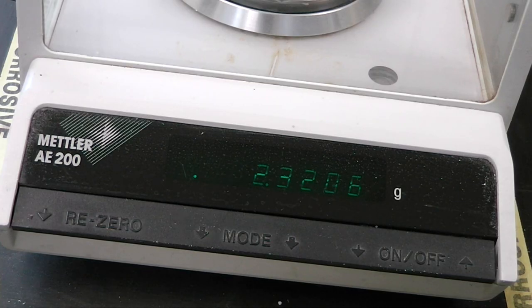When taking your final reading, be patient. The number may oscillate between two different values — simply wait for it to stabilize. In this case, it is 2.3207 grams.